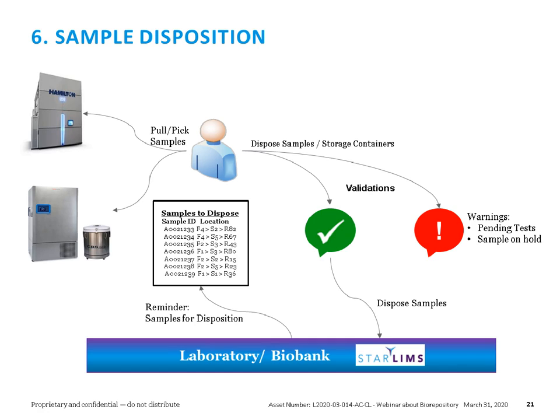Now, the sample disposition doesn't mean that we are deleting the samples. The LIMS should never delete the data of your samples.